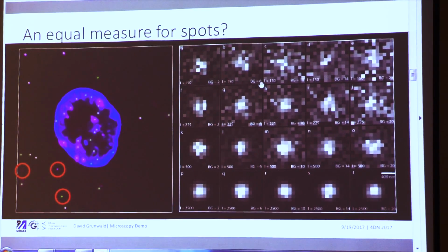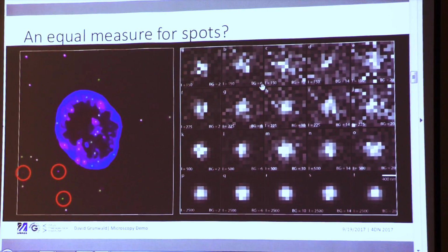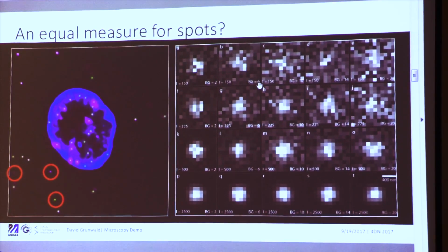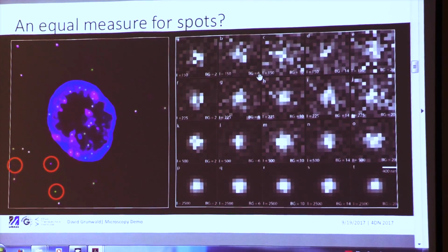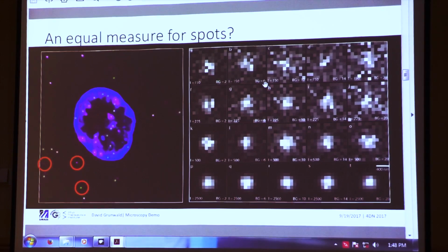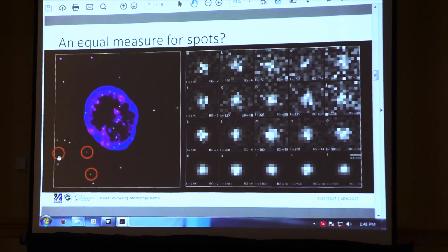Now, the dominant method in the thinking and the discussion around all the different problems that we have became single molecule FISH. Single molecule FISH because it is at this interlevel where, yes, what you get are diffraction limited data. It is a well-established method. It should be establishable in every lab. For the record, in my lab, students need half a year before it works for them. But I have been in I don't know how many meetings with students of mine, with students of other people, with other PIs, with whatever, friends over a beer, looking at images and then this question, oh, this is a signal, right? But why is this not?